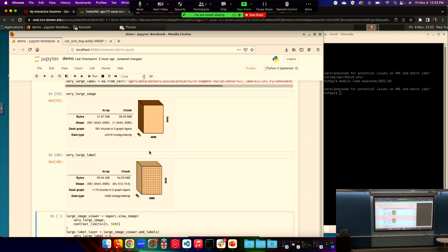that is also saved on disk, but you're saving it as a Zarr array. Zarr is basically a distributed storage backend for arrays like NumPy arrays. It does automatic chunking for you, and when you save the arrays to the disk, it also provides compression.